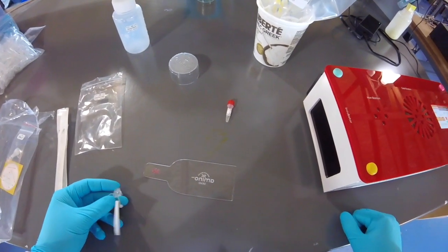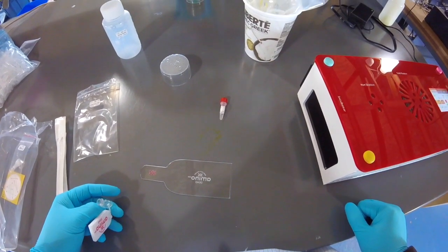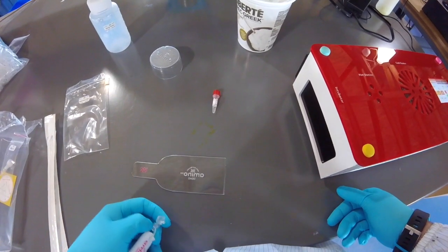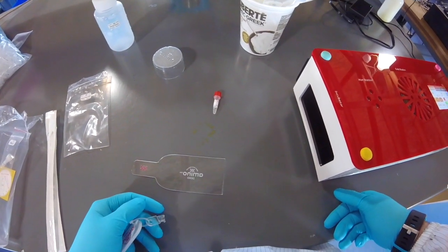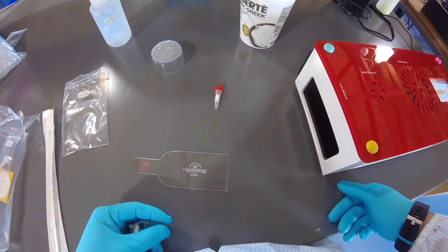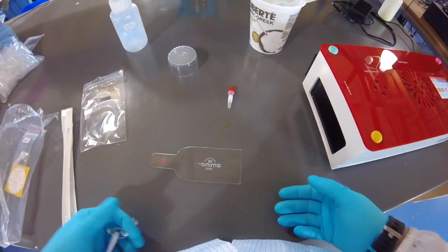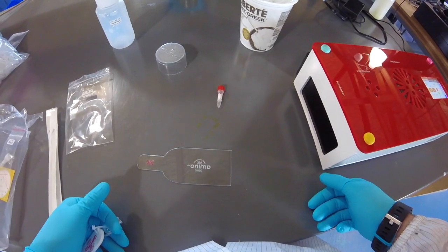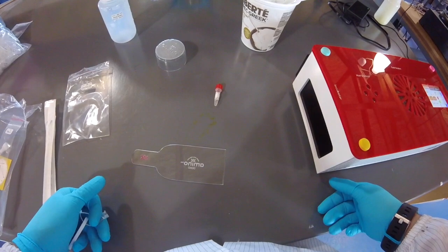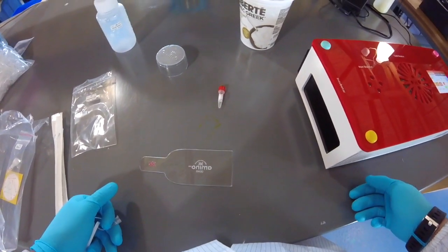I'll check back in about 24 hours and maybe 48 hours and 72 hours, and we'll see how the results are going. Actually, on that note, though, the positive control cells should grow within 48 hours for sure, and you should definitely start seeing growth at 24 hours. And this is because, another thing I didn't mention, when you engineer them, they've gone through this kind of horrible process where you heat shock them in salt and you're recovering them, and so they're also more slow to grow than cells that haven't just been engineered.